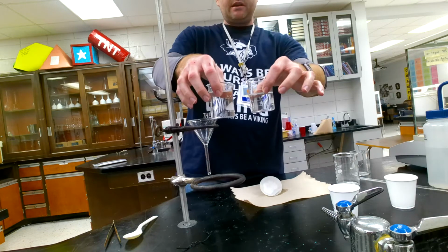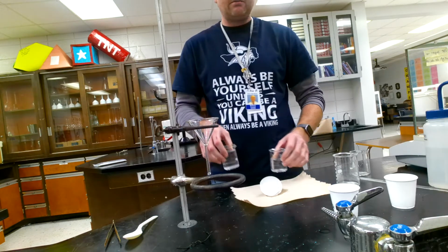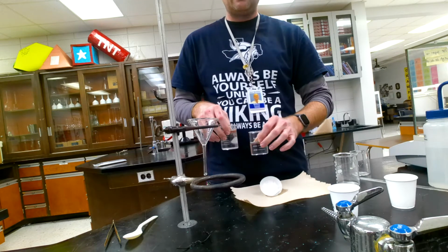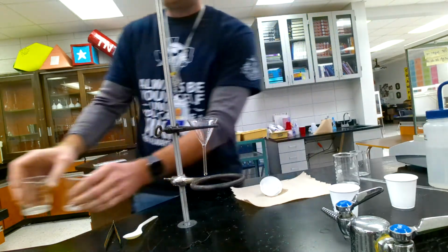This stuff right here is called the filtrate. This is the stuff that came through. This is all water. Ideally, we would run it through the filter again, just to make sure we caught every little thing. But we're just going to go ahead and dump that one down the sink, because it's just water and potassium chloride, which is just salt.